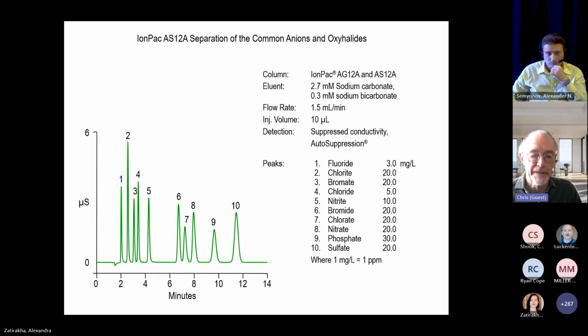And so we had an intense R&D effort led by several chemists. There were actually two projects in parallel, but this was the product developed by Charanjit Sani. And it uses what we call a super macroporous resin. It's a resin substrate that's nominally around 1,000 angstrom, but it's somewhere between 1,000 and 1,500 angstrom pore size.